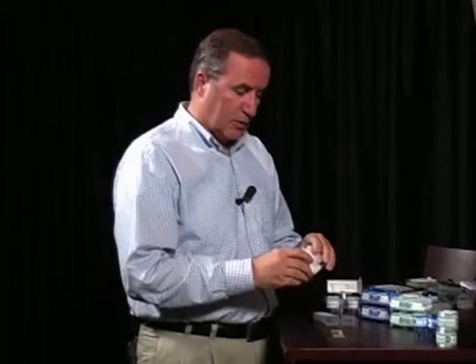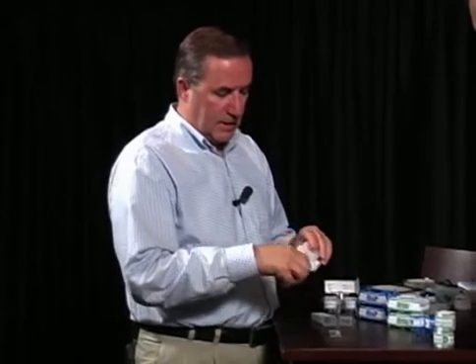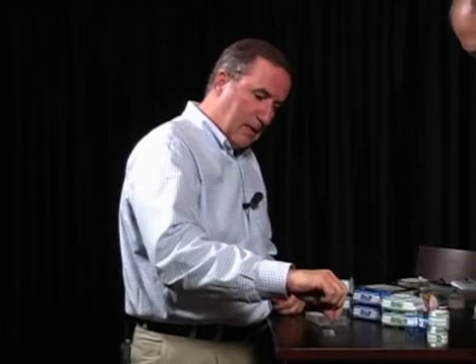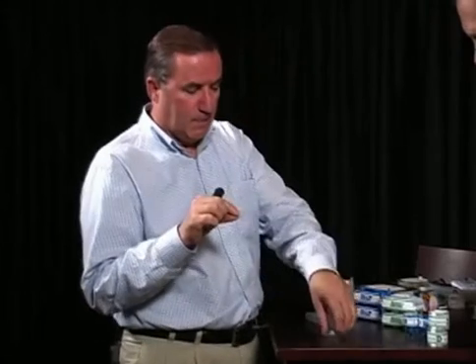And what you want to do is you will want to prepare your slide and put it on a clean surface. I always like to pull a lead tag end out. Take about an inch of tape, holding it only on the edges. Bend it back like this, because you don't want to use a lot of pressure on a surface when you take a tape lift, because you're looking at microscopic particles. So if you see it, you've probably got too much on it. So what you want to do is just lightly touch it to a surface and let the tape bow and the adhesive pick up the fungus, and then you want to lay it on your slide. Now, notice how I'm laying that on there.